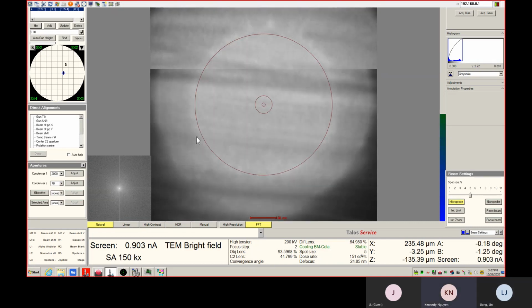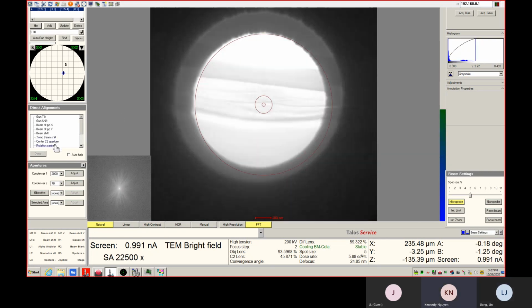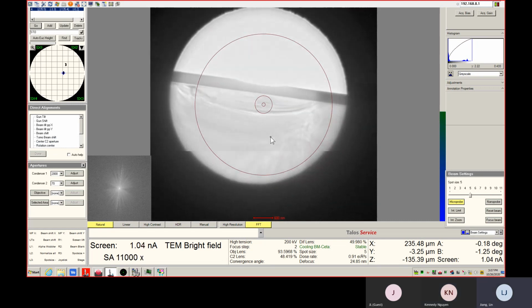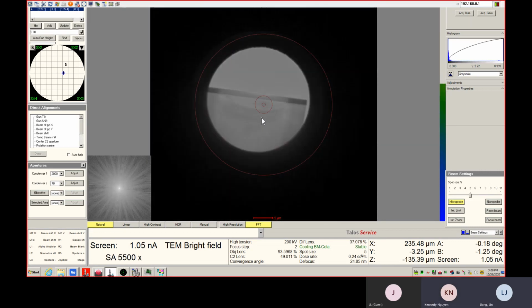So I'm gonna look for the rotation center or the zone axis first before I do the rotation center and other stuff. Yeah, I think you should adjust the sample to the zone axis first, before you adjust the PPX and PPY, because if you rotate your sample, you can change your eucentric height, right? Okay. But we will check that later. We could try it again afterwards.